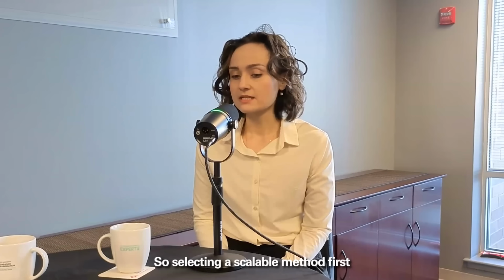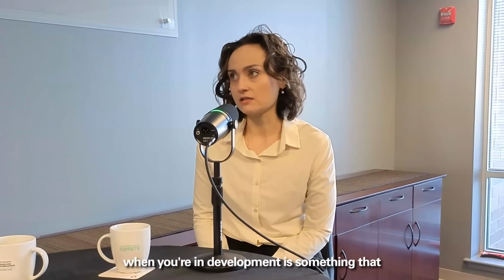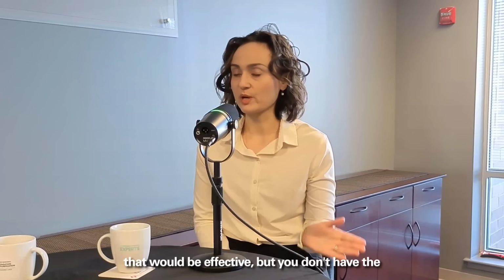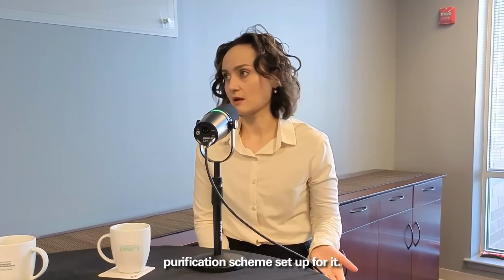So selecting a scalable method first when you're in development is something that I would recommend, but it's a big challenge when you identify a molecule that would be effective, but you don't have the purification scheme set up for it.